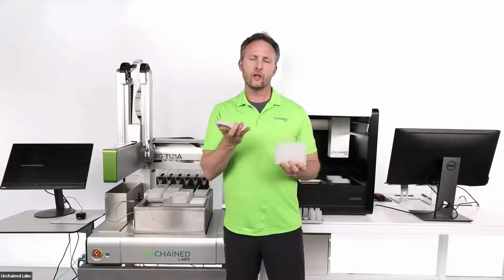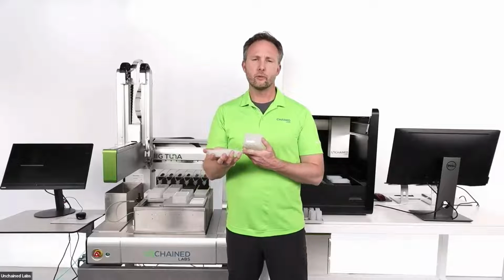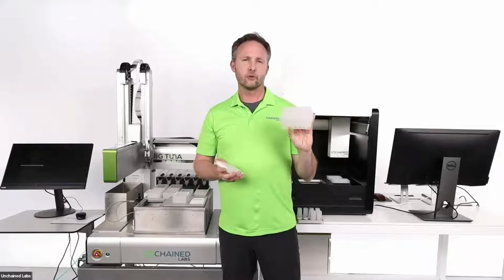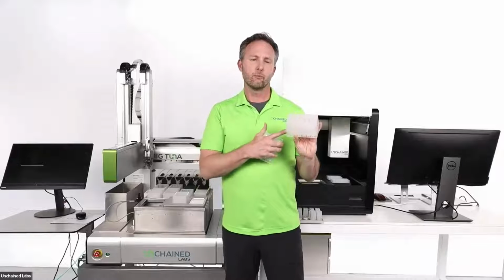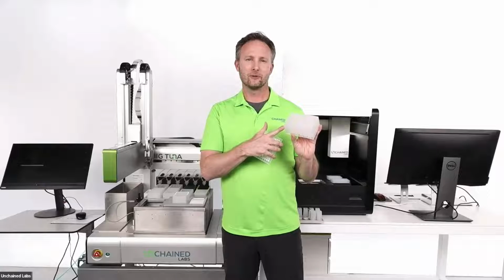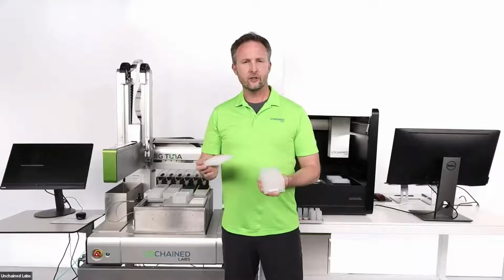With the unfiltered 96, your samples can be in a working volume range from 100 microliters all the way up to 450 microliters. And for the unfiltered 24, you can work from 450 microliters all the way up to 8 mL. So that's really where your samples start, and they're very easy to use.